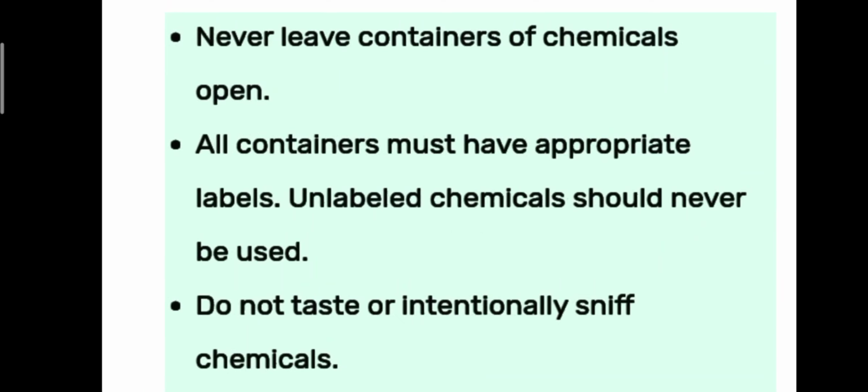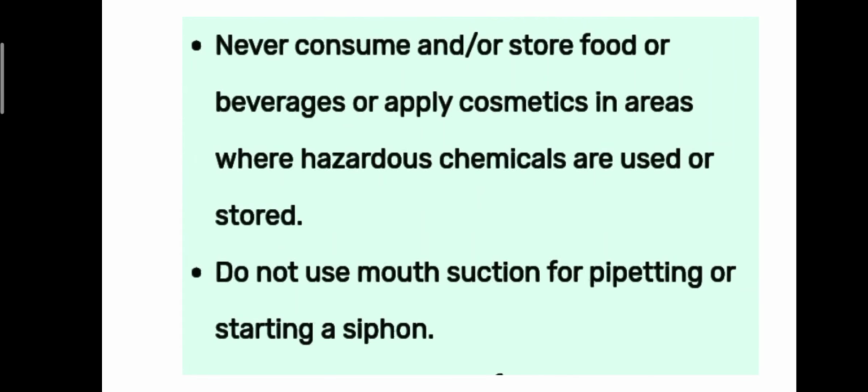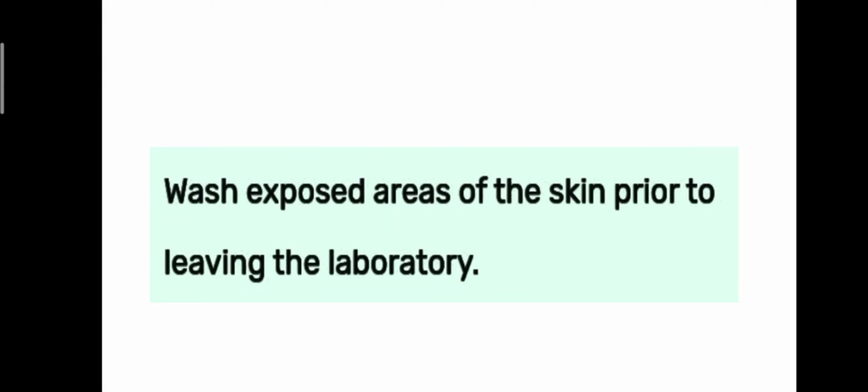Never leave containers of chemicals open. All containers must have appropriate labels. Unlabeled chemicals should never be used. Do not taste or intentionally sniff chemicals. Never consume or store food or beverages or apply cosmetics in areas where hazardous chemicals are used or stored. Do not use mouth suction for pipetting or starting a siphon. Wash exposed areas of the skin prior to leaving the laboratory.